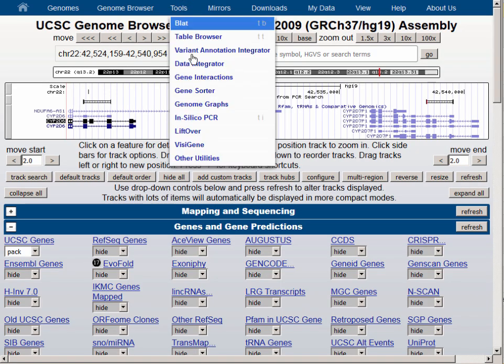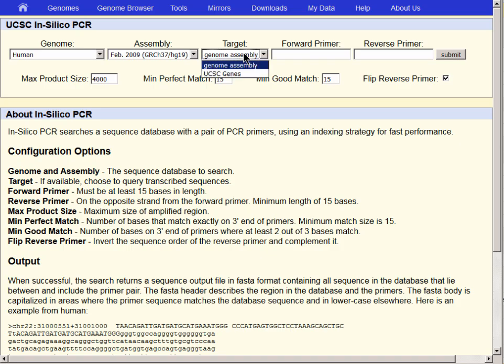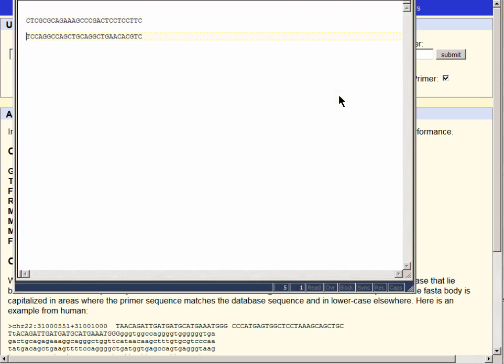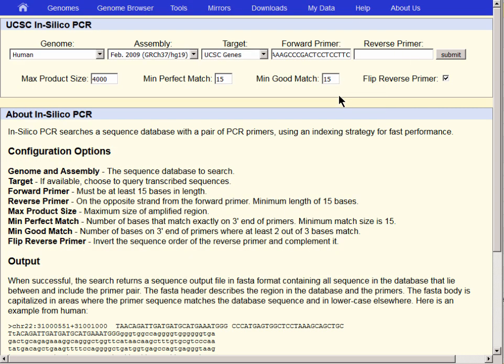Let's go back to the ISPCR tool and reset the target to UCSC Genes, which is the in-silico equivalent of having spliced mRNA as a template. We will paste the forward primer, still in our copy buffer, into the forward primer box. Then we'll go back to our text page, grab the reverse primer, paste the reverse primer into its box, and notice that the flip reverse primer checkbox is still selected. Then hit Submit.